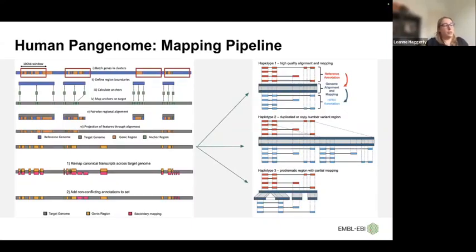Okay, so then for humans, our work aligns with the Human Pangenome Reference Consortium, as I mentioned, and all of this work has been described in the Nature paper in 2023, where they produced reference quality assemblies for 47 individuals representing 94 haplotypes, and these were from really variable populations around the world. In release 2, then the HPRC covers 232 individuals or 464 assemblies, and so there's a massive representation going on here, and this is just growing and growing.